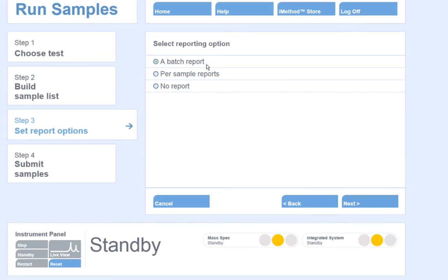My next option is to output a report after each individual sample is run. The third option is to select No report. Choosing this, you can process your data at a later time. Select your option and click Next.